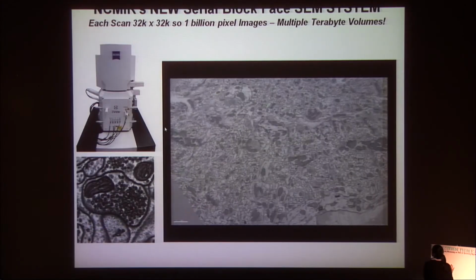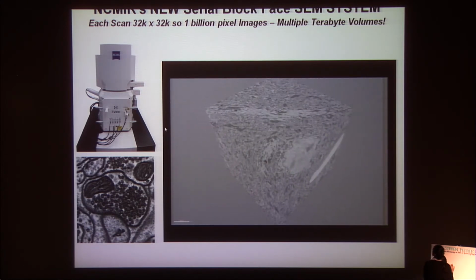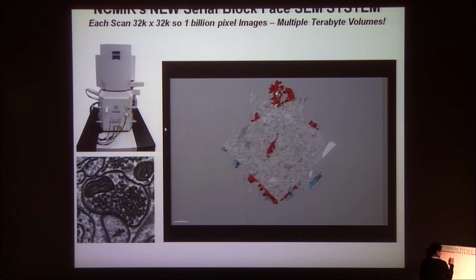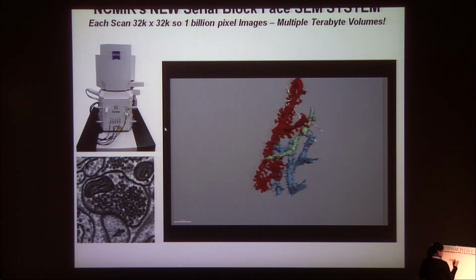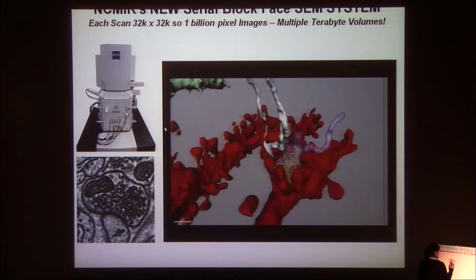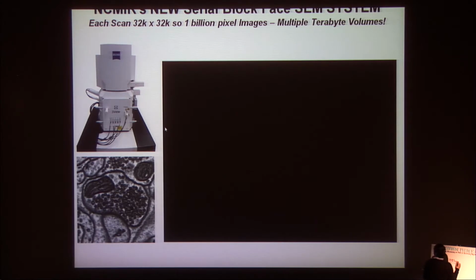But I will amplify a very key point, and that is that the microscopy data we're producing is getting truly massive. If we look at just one technique that we're exploring in the center, serial block face scanning EM, this is a technique that combines an ultramicrotome with a scanning electron microscope. You're essentially rastering across the block face and then slicing off the top layer and then imaging all the way through the tissue in that format.